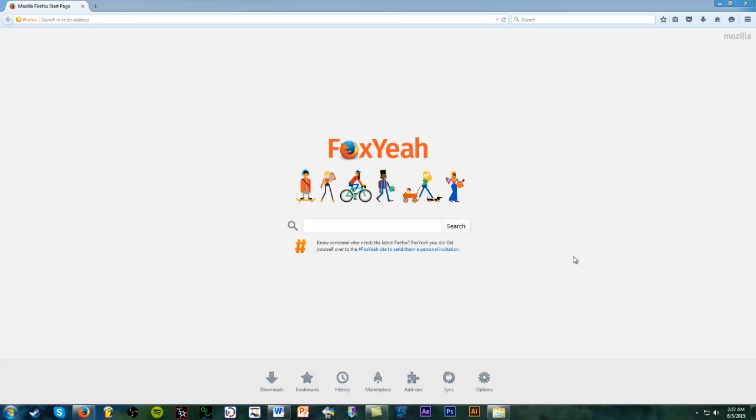Okay, so I'm going to take a break from the APE videos that I have been uploading. Instead, today we're going to talk about something different. So let's say you have two or three or a couple of sequences that you want to align. Is there a program out there that you can use to align them very quickly and accurately and reliably? Well, good news is there is.